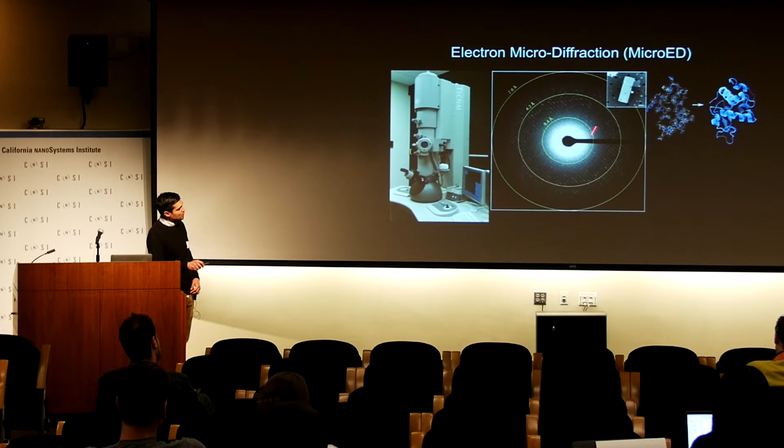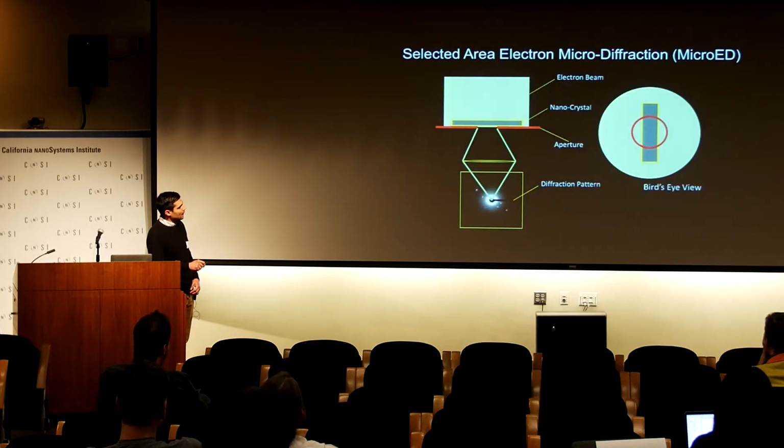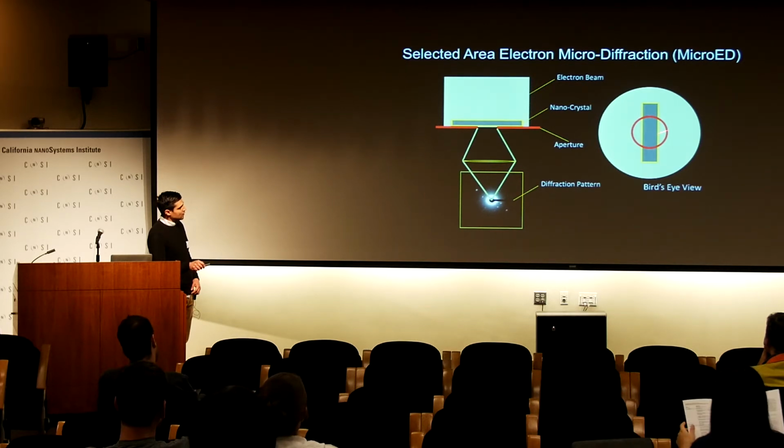This is a real diffraction pattern from one such protein crystal. So this is the protein crystal. This is a half a micron scale bar, so you can see that it's very small. And you can see that there are thousands of spots. So this is the typical type of problem I'm discussing when we're talking about the canonical way of addressing crystallographic data reduction. This is just another schematic looking at the crystal top down.